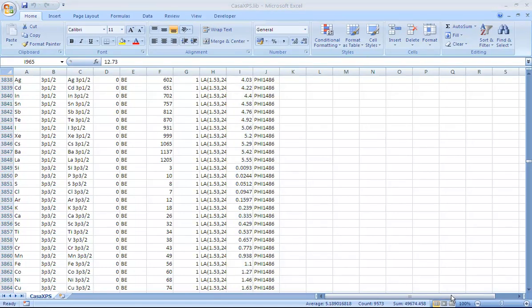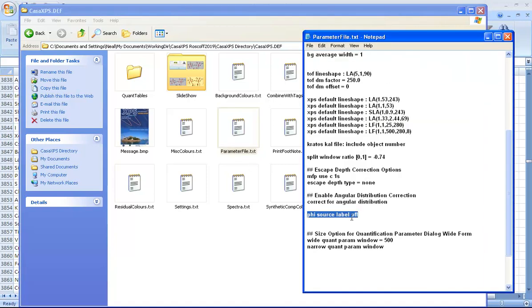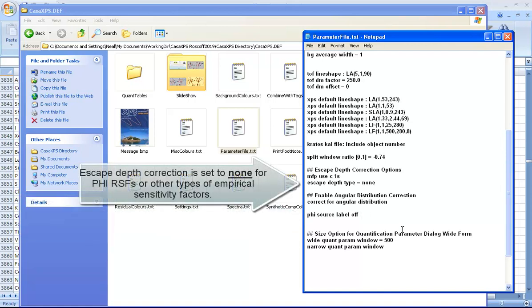When a VAMAS file is created by CASA XPS, it's possible to configure the source label that is entered into the VAMAS blocks. In the CASA XPS directory that contains the default files, CASA XPS.def, there's a file called parameter-file.txt. Parameter-file.txt includes an option where you can enter PHI source label or change it to PHI source label.